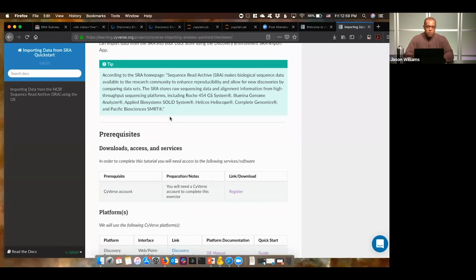Next question. In the classroom, I'd like to have students do the same analysis so I can run the analysis before and know what to expect. No, that's perfect. Does this go against the use of resources? That's exactly what we'd like you to do. Go ahead and analyze it yourself.